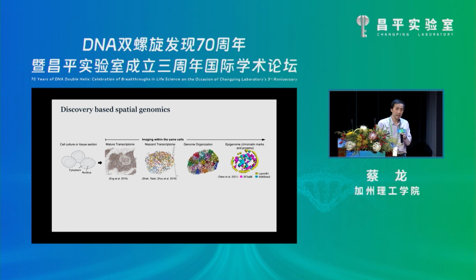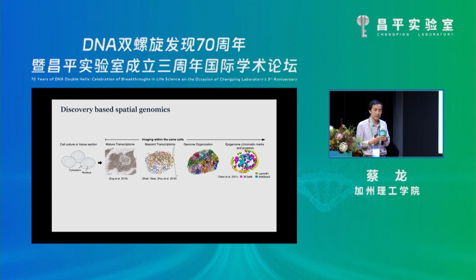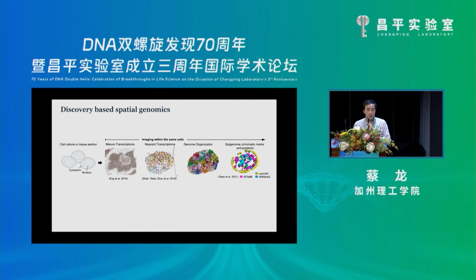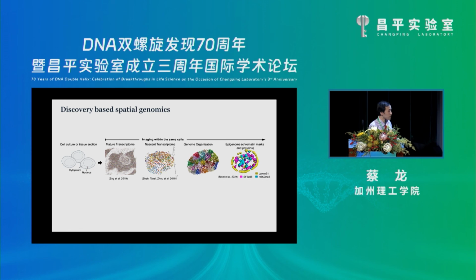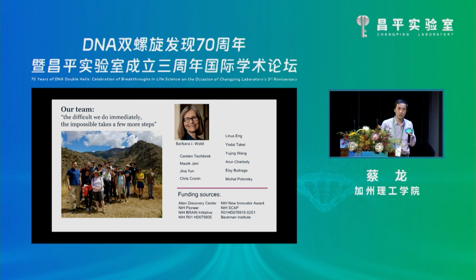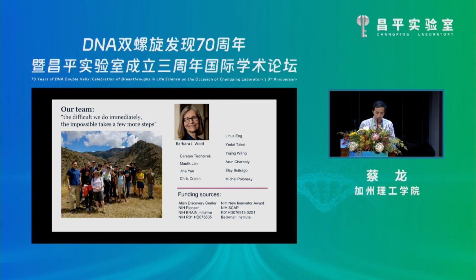Okay, let me wrap up by saying that hopefully I showed you a glimpse that it's possible to do discovery-based spatial genomics, beyond just confirmation with pretty pictures of tissues. You can actually get biological insights by looking at transcriptomes at the level of genomes, and also looking at chromatin structures along with antibody marks, all in the same cells. That's all possible because we can scale to the level of thousands of genes and not just be confined to 100 genes or so.